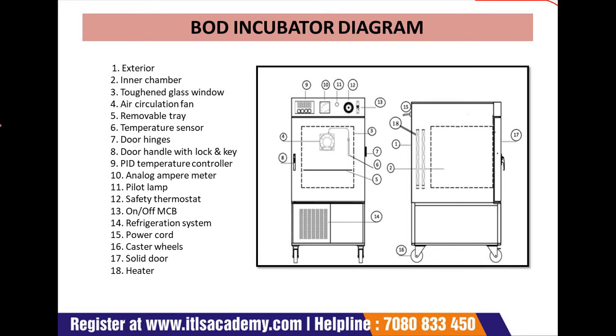So in this picture you are seeing different numbers. Number one indicates the exterior. Second is the inner chamber.